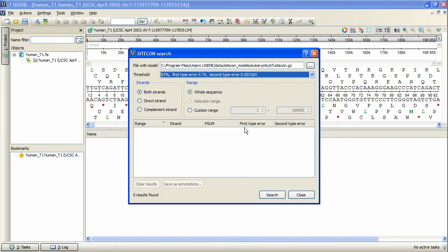The remaining options are standard search options: strands, and the sequence region to search in. Press Search.